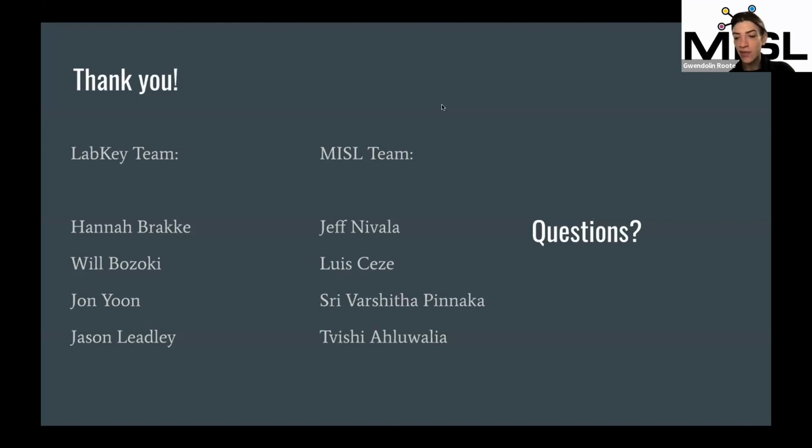Getting people to switch over from something that they're familiar with to something that they're unfamiliar with is not simple. But I think encouraging people to start new things is really great. I think making your own training goes a really long way. So I will say LabKey Sample Manager has a lot of really wonderful training materials on their own website. It was really easy for me as the manager to learn how to use the software from LabKey's training.